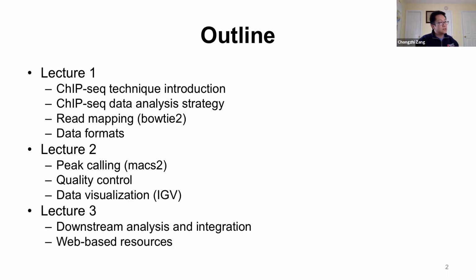This slide is my current plan for the 3 lectures this week. Today, for lecture 1, I'll give you a brief overview about the ChIP-seq technique and data analysis strategy. The idea is to tell you what part is important and what things you need to keep in mind when processing and analyzing ChIP-seq data sets.